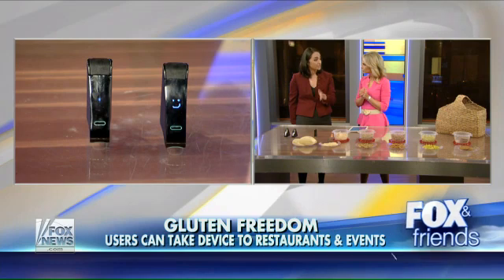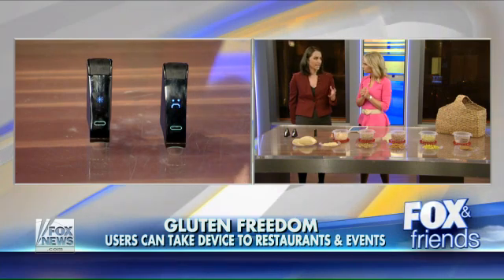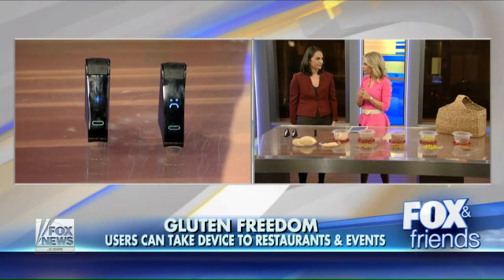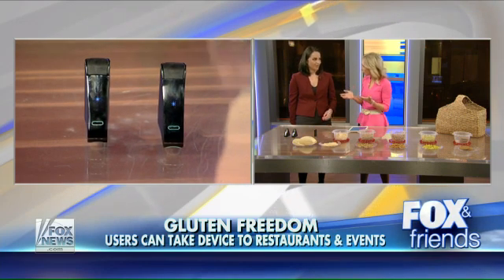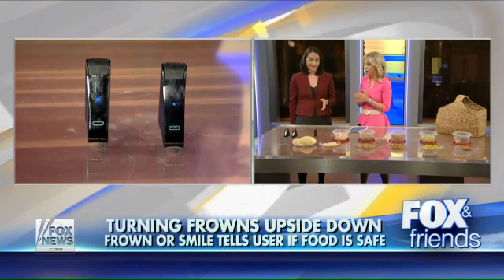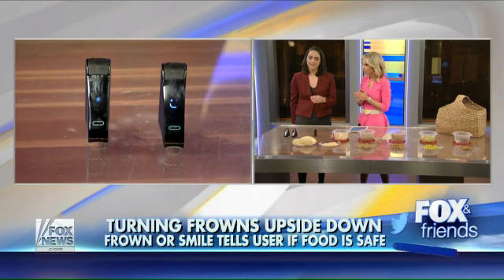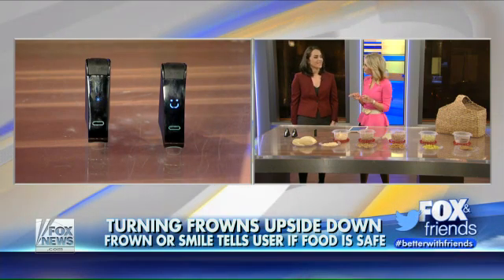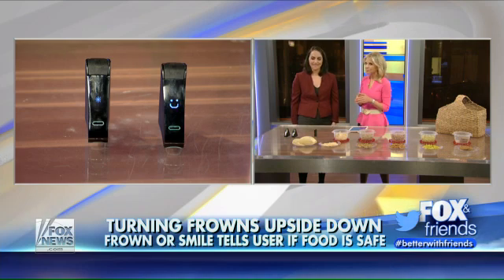How accurate is this? Right now we're developing for 99.5% accuracy at 20 ppm, and we're going to be validating all that data with third parties when we ship. We're planning to ship the product by mid-next year. You can pre-order it starting tomorrow at a discount, and it will be shipped by mid-next year. If anyone's interested in doing that pre-order, they can go to NimaSensor.com — N-I-M-A-Sensor.com.